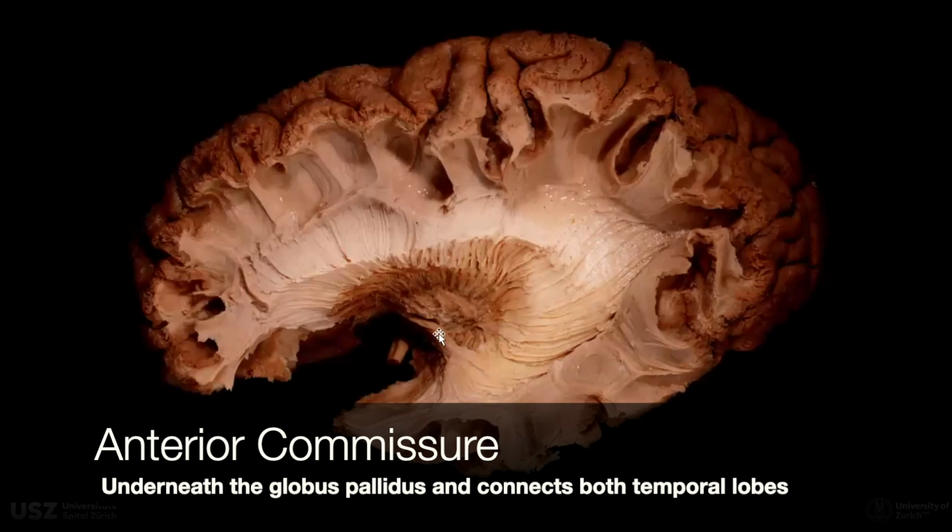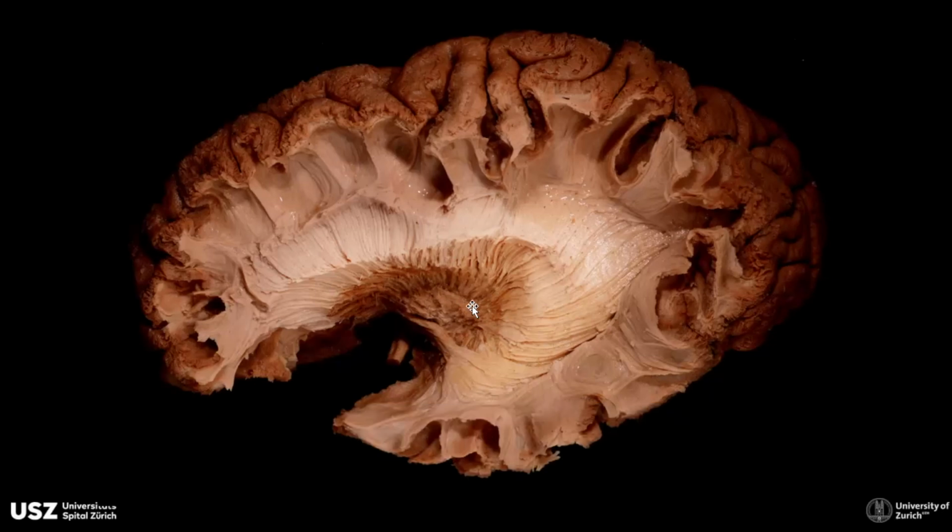The anterior commissure runs under the globus pallidus in the so-called canal to connect both temporal lobes. And this will be the end of our lateral dissection, which will take all of today and maybe a bit of tomorrow morning.